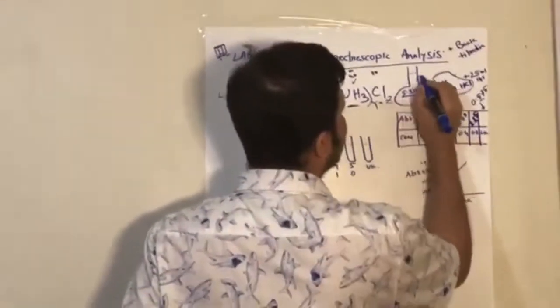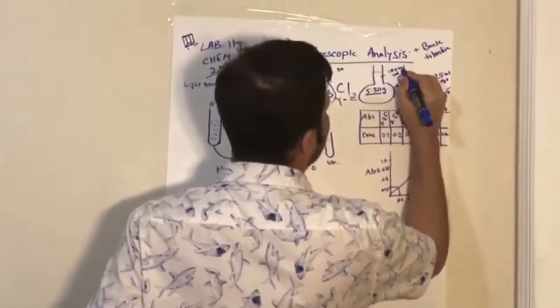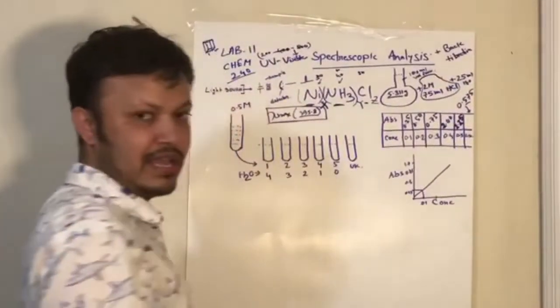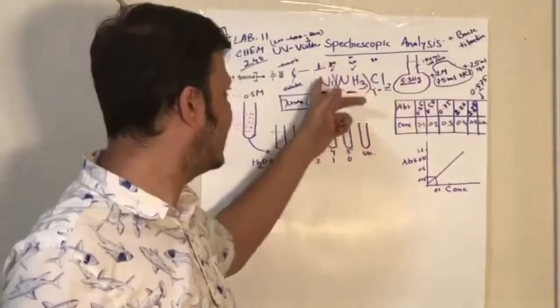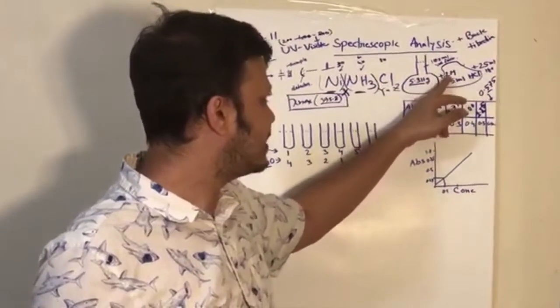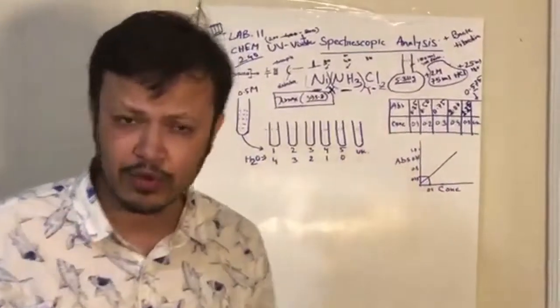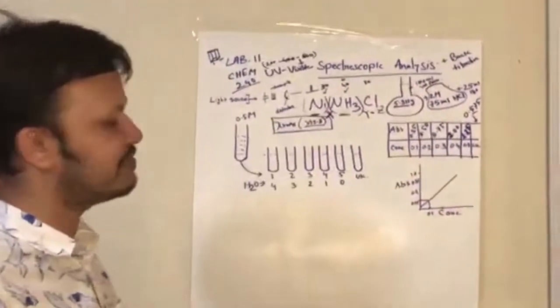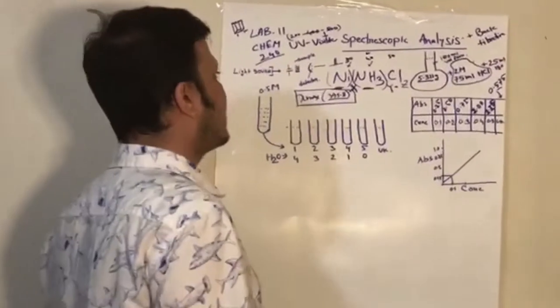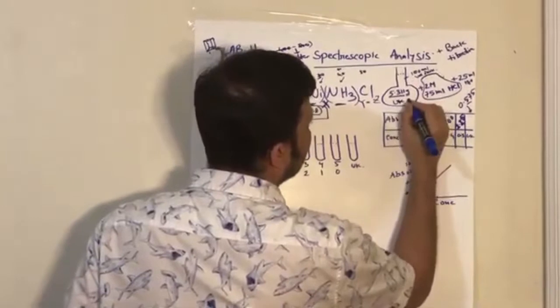You take it in a 100 ml volumetric flask. So in the 100 ml volumetric flask, you have taken 5.311 gram of the nickel ammonium salt, and then you are taking 75 ml of 2 molar HCl. Everything is dissolved, and you see that there will be a blue color. Then you fill up to the mark by adding 25 ml of deionized water. We call this the unknown solution.